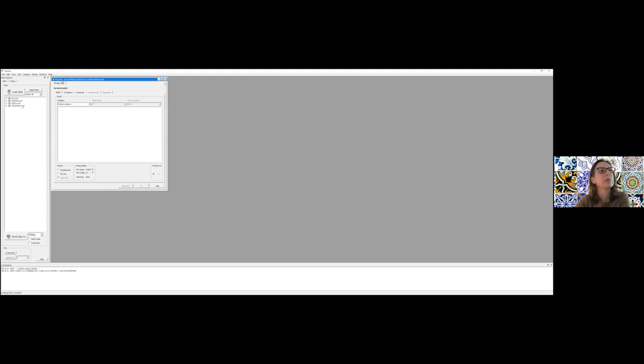One thing you have to be careful about when you're using SAS-View is that it very often by default selects data, and you want to decide which data you're going to look at. So to make sure that you don't have some of these data files clicked by mistake, I always start by going here where it says select, and I go unselect all, so that I then have to specifically click on the one that I want to look at, so that nothing is clicked by mistake. And if you press the little plus here you can open information about the data, and you'll have your data there, and fit results once we have some fits will be listed there as well. Okay, so we'll come back to this in a second.